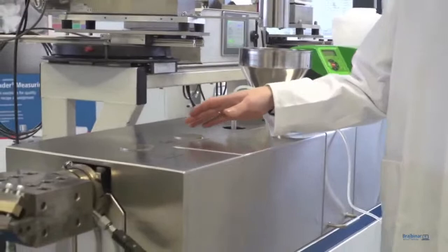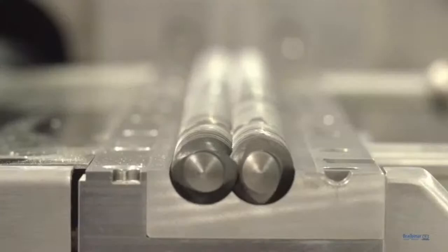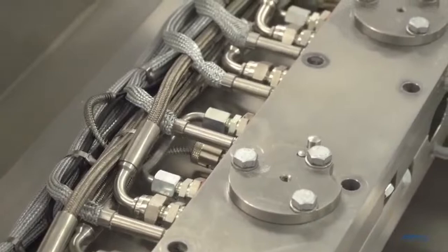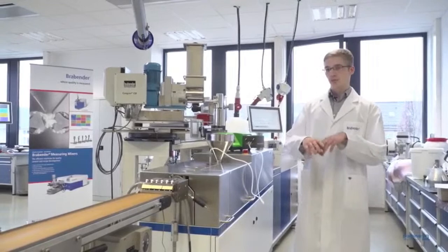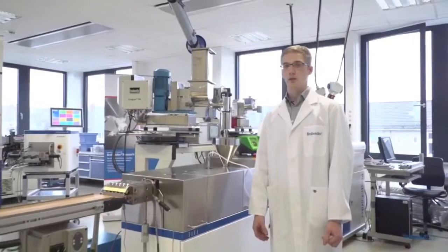Afterwards it has time to be heated, and it's under pressure and shear. In this process part here, the seaweed cells are being disrupted and the carrageenan is released from the cell walls. Then we have the carrageenan mixed into all the other parts of the seaweed, and it's available as a new polymer to create the new bonds.